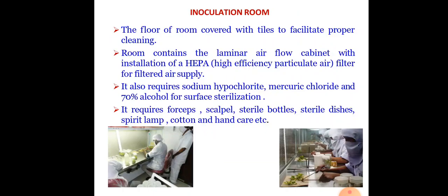And the inoculation chamber or inoculation room should be in an aseptic condition, with the floor and rooms covered with tiles to facilitate proper cleaning. The room contains the laminar airflow chamber or cabinet with HEPA filters also. It requires sodium hypochlorite, mercuric chloride, and 70% ethanol for the surface sterilization. It requires forceps, scalpel, sterile bottles, sterile dishes, spirit lamps, cottons, and hand cans also, which have to be provided in this inoculation chamber.